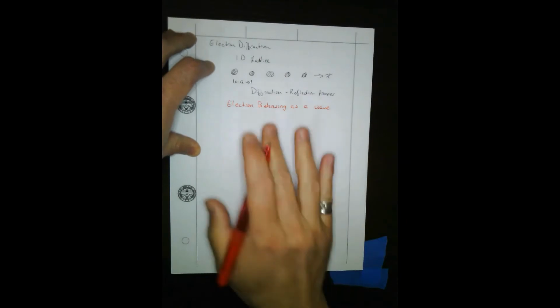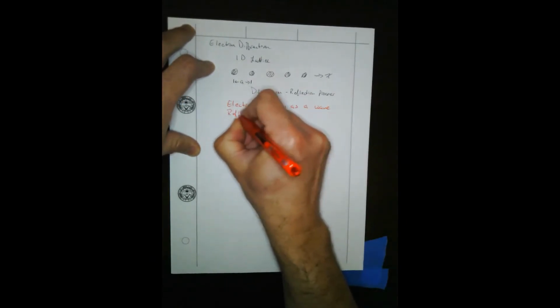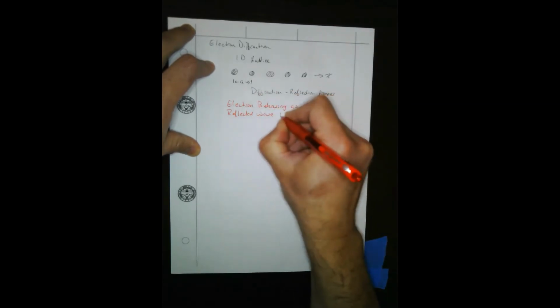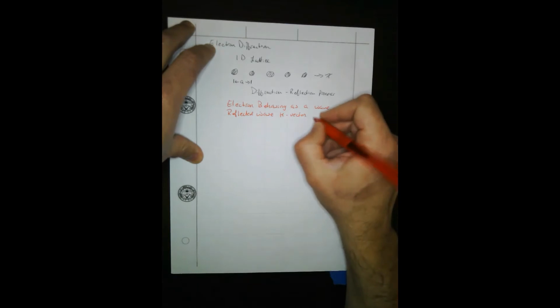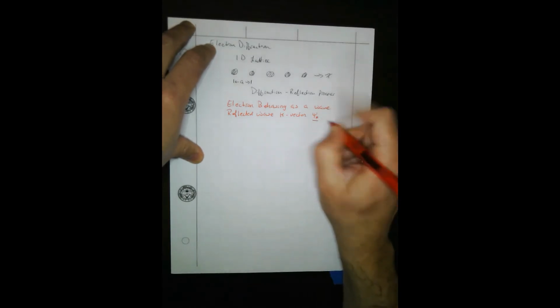Now, this reflected wave is called the k vector. We've seen this before, and it has its own wave function defined by psi sub k. So we're dealing with k space, some kind of abstract constructs, which we come across repeatedly when we talk about electron diffraction.